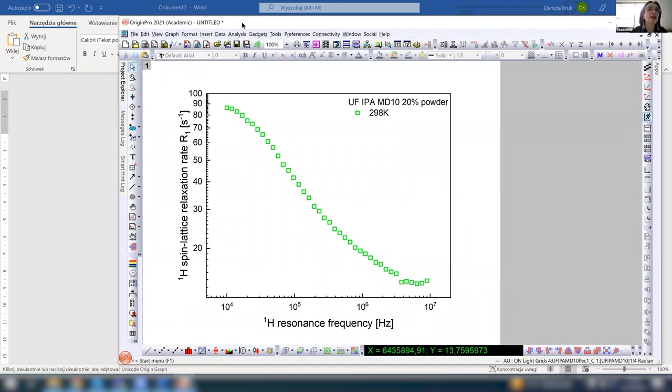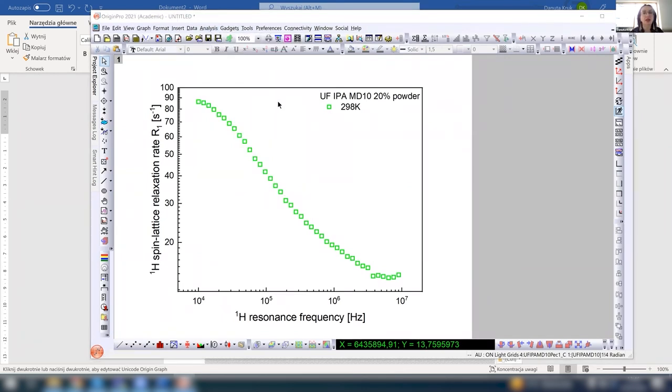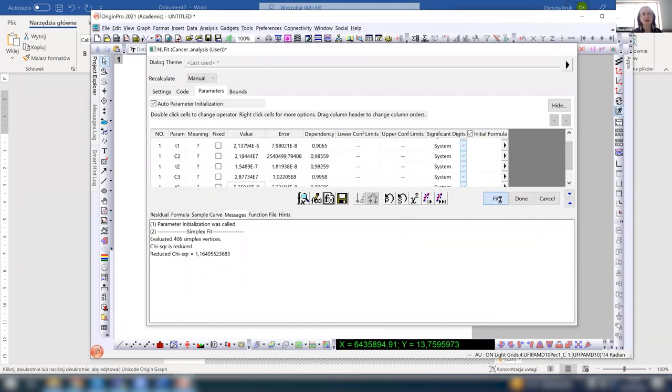And let me try to do exactly the same thing and see what happens. Analysis. So the old trick. I put here everywhere like that, because this is a kind of typical value. Here we had like 13. Let us keep it constant. And a slow process, which is usually of the order of -6, an intermediate one. And sorry, I should have 13 here, and here I should have -8. So a kind of typical input.